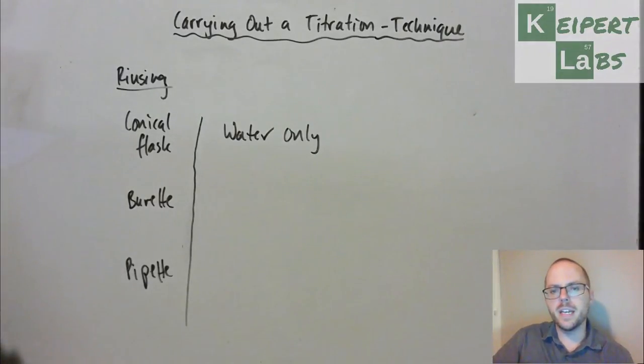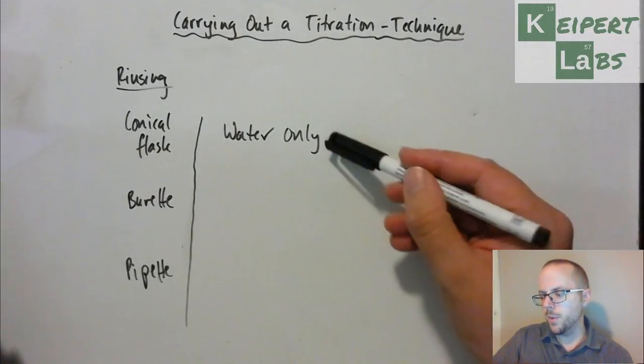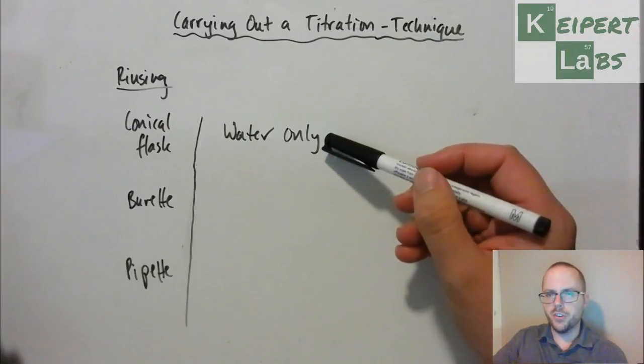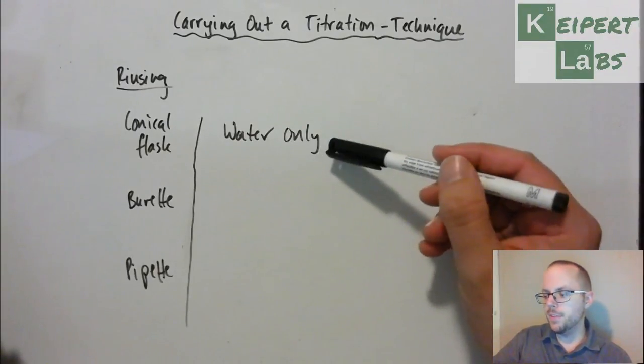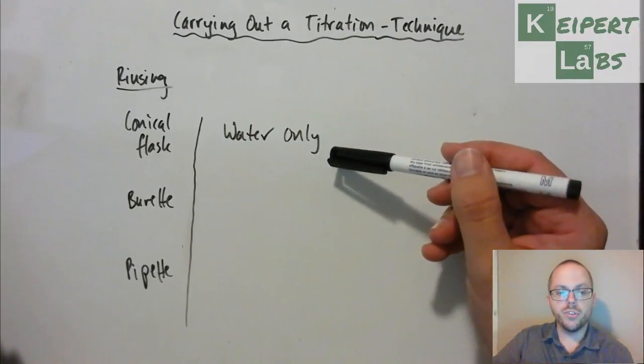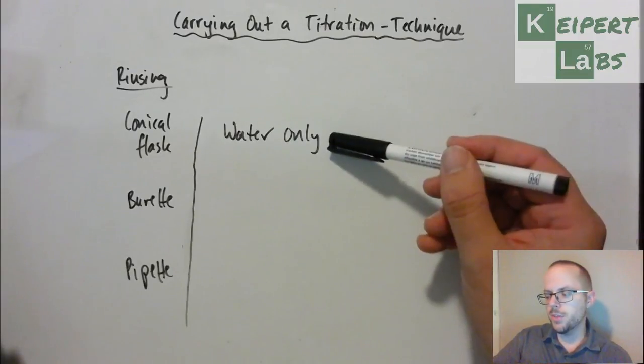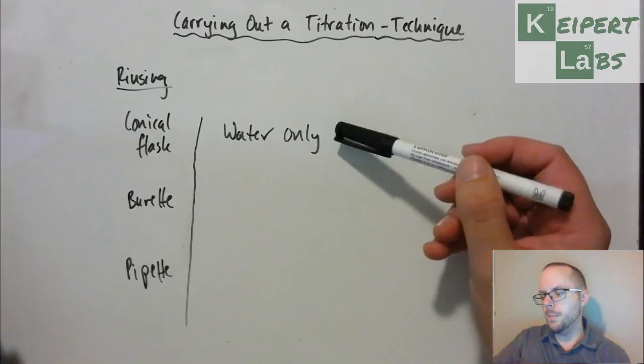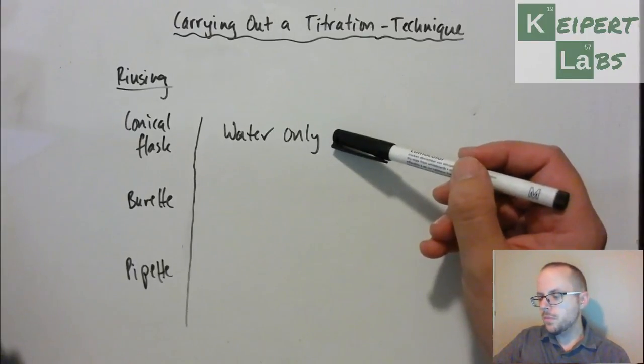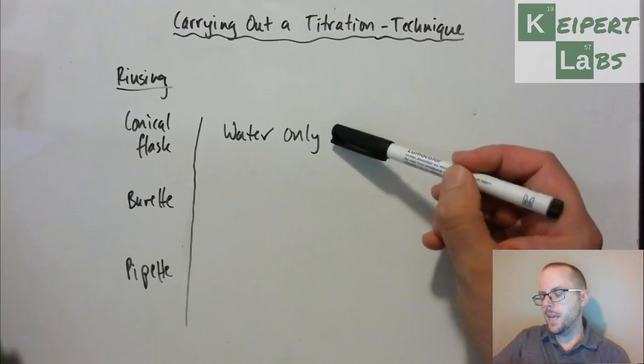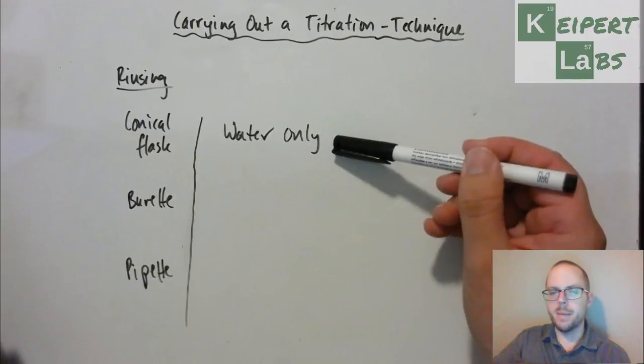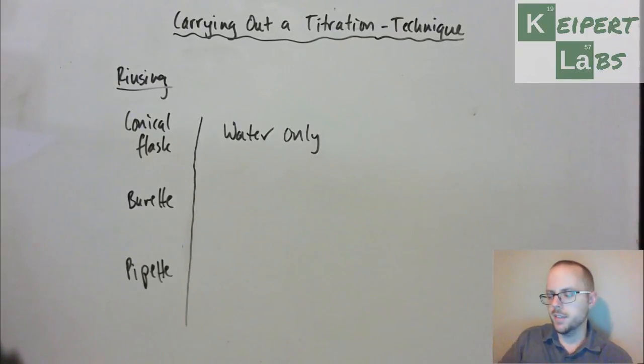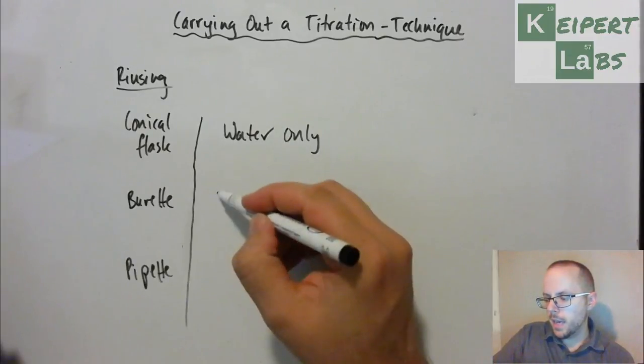So what we do then is that we only rinse a conical flask with water. This will help to clean away any other contaminants. Anything that was in the flask before you did your titration or any leftover residue from a previous trial of a titration, because what you'll see when we do titrations is that we do multiple trials so that we can get an average. So it will rinse away anything that's contaminating, but it won't potentially jeopardise your existing titration.